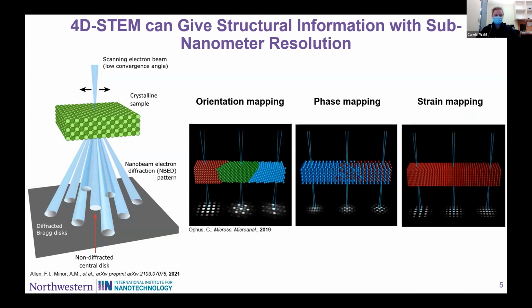And so when we do that, I'll show first a pretty simple model system that's just silver copper. So we'll have two FCC phases that are immiscible.